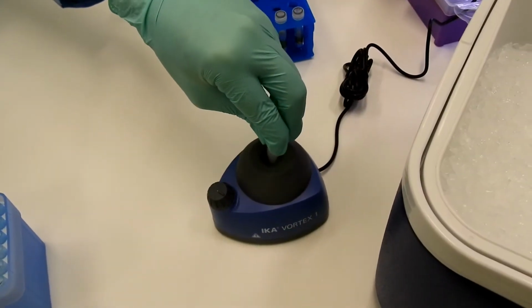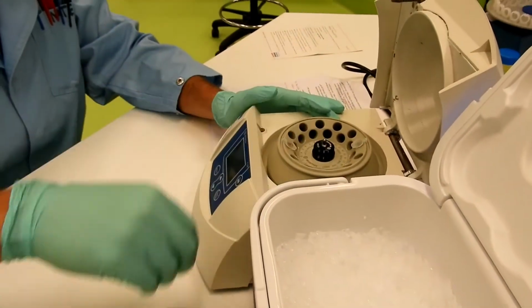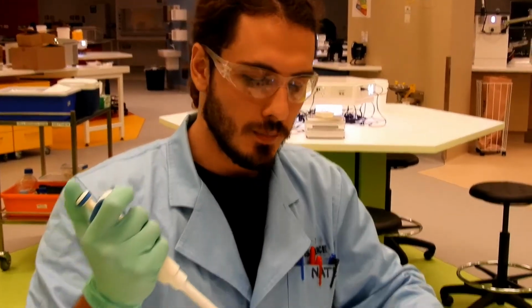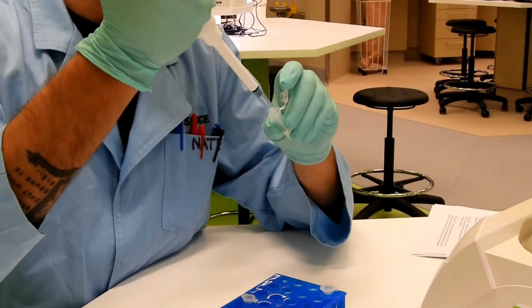Vortex, and then place on ice. We'll then centrifuge the sample at 10,000 g for 1 minute. We'll then transfer 750 microliters of the supernatant into a fresh tube. It's important again to avoid the pellet, as this pellet contains PCR inhibitors.